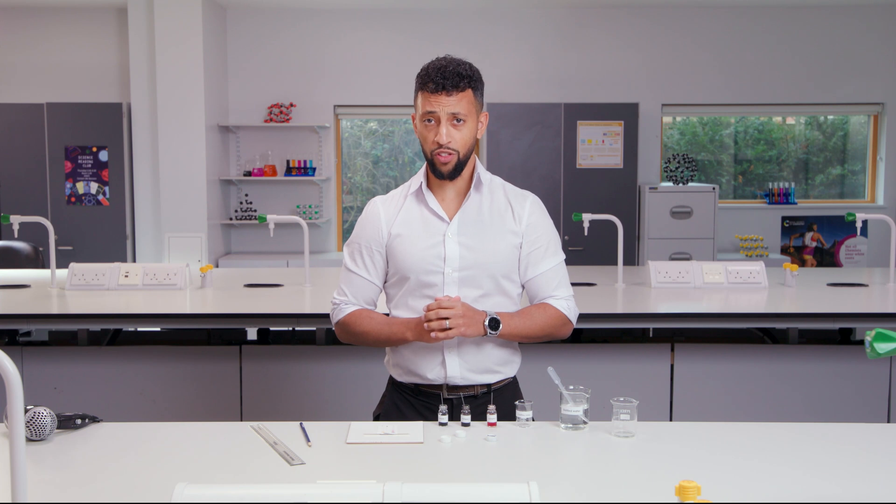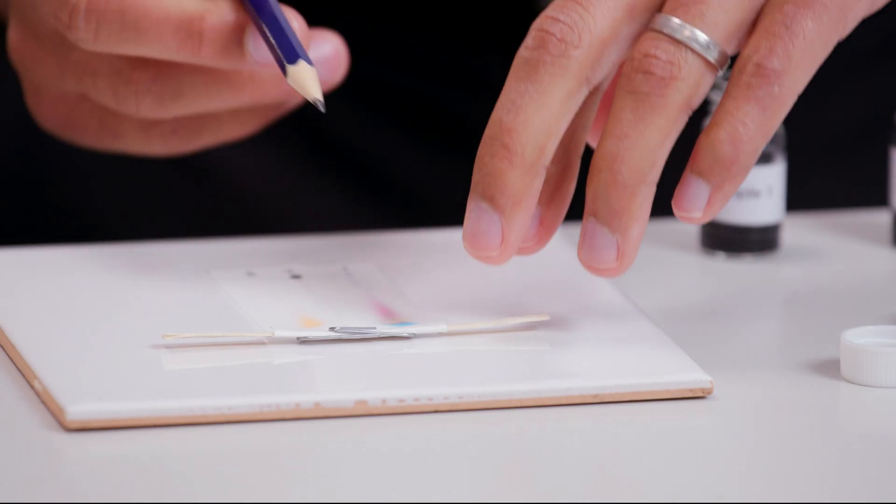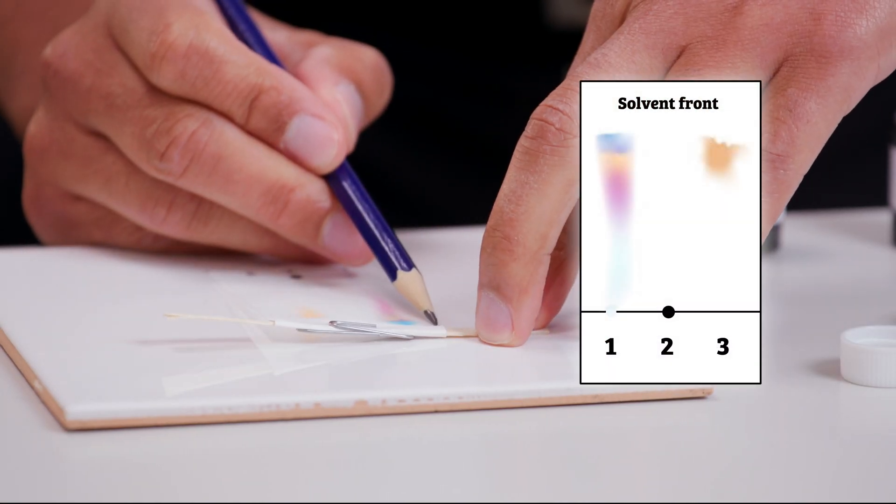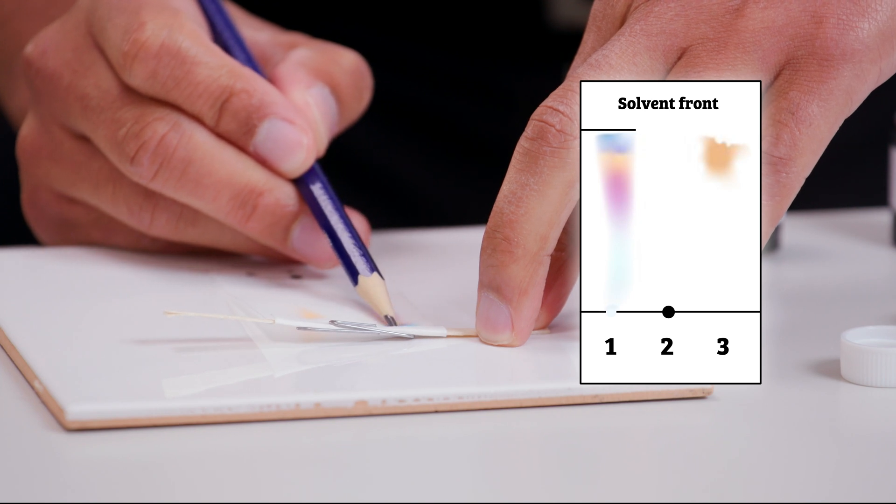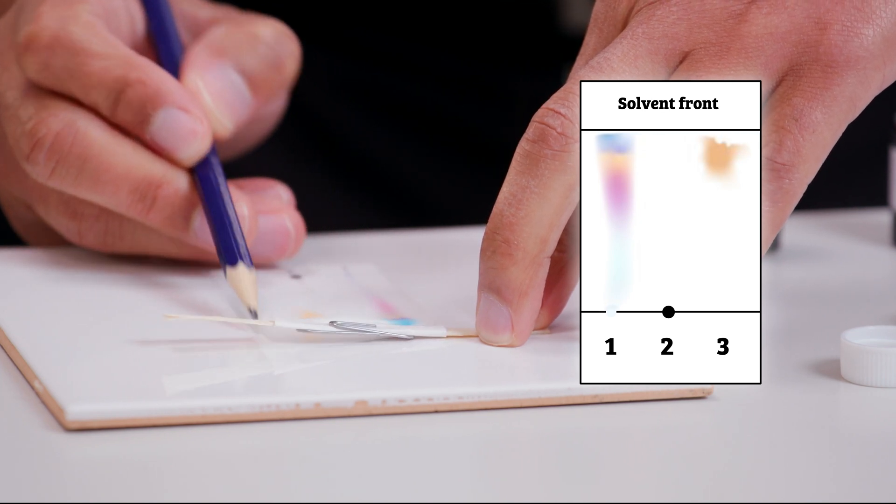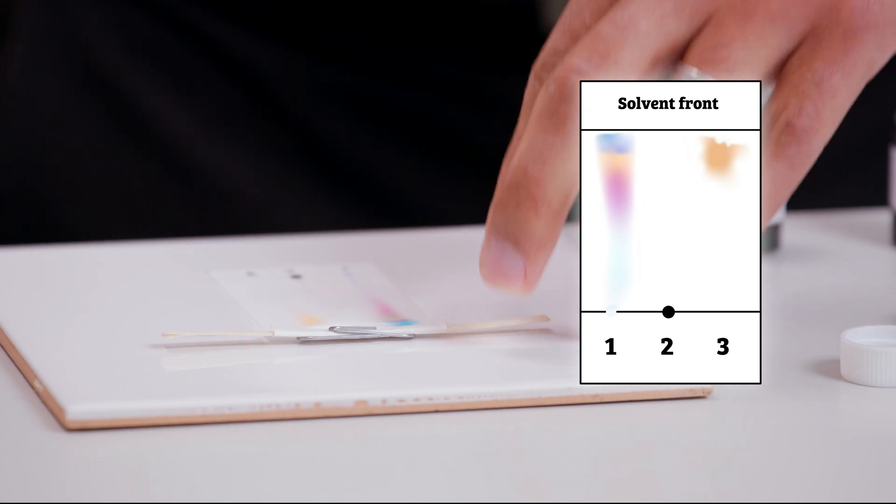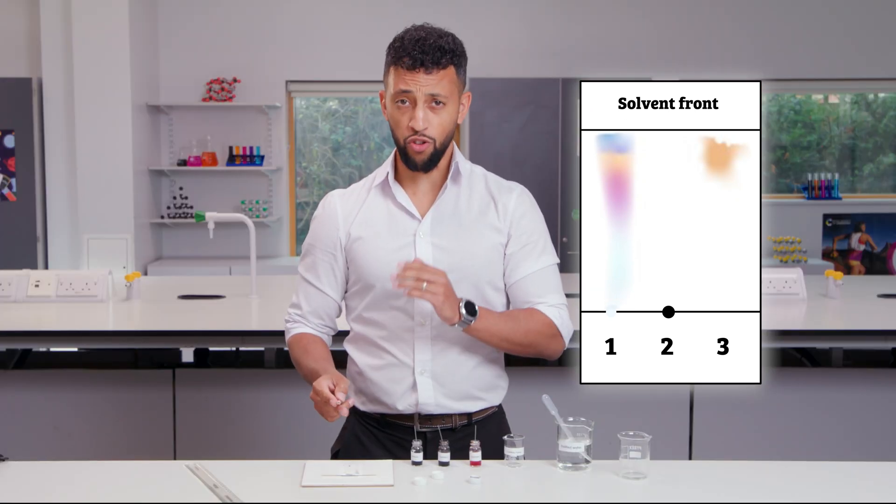Now before I do this, I need to draw where the solvent has got to. This is the solvent front.